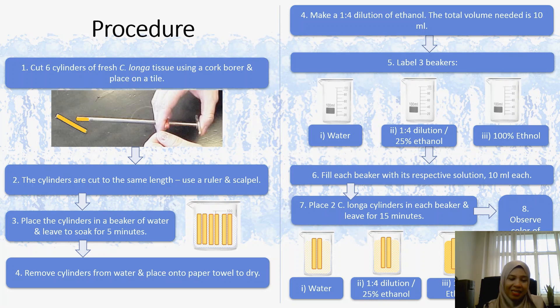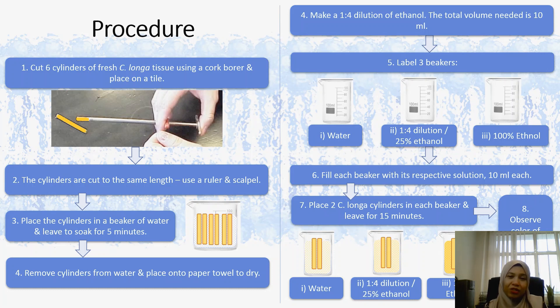Place the cylinders in a beaker of water and leave them to soak for 5 minutes. After that, remove the cylinders from the water and place them onto a paper towel to dry.